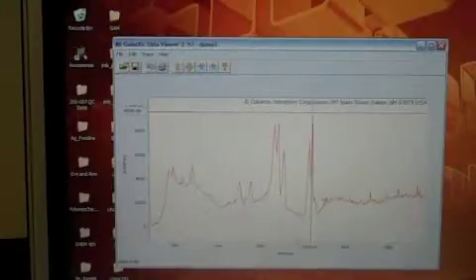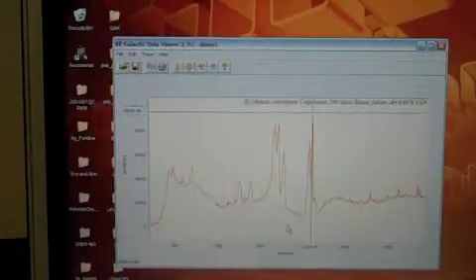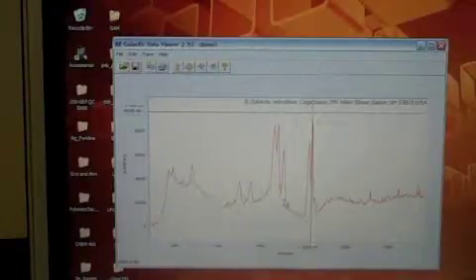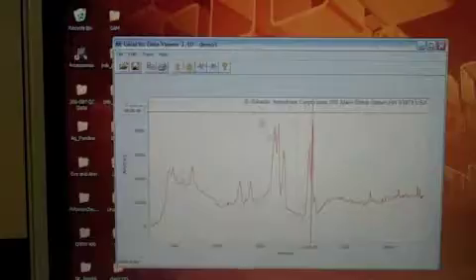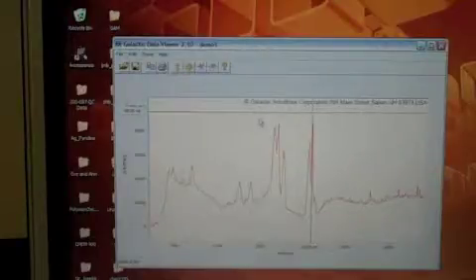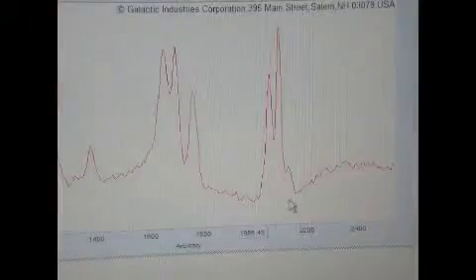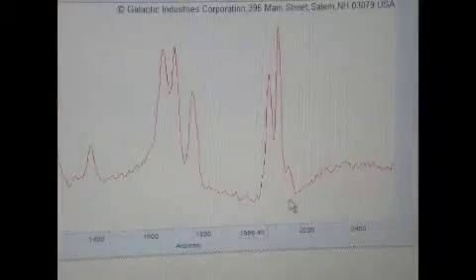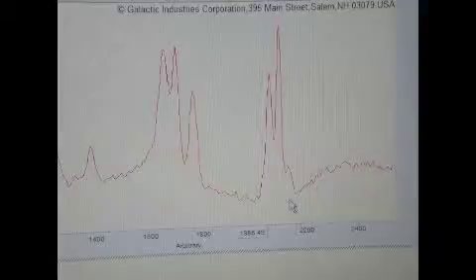You can read the XY coordinates anywhere that you position the cursor on the spectrum. For quantitative work, you should read the peak intensity with respect to its baseline. That is, you should record the peak height above the baseline.